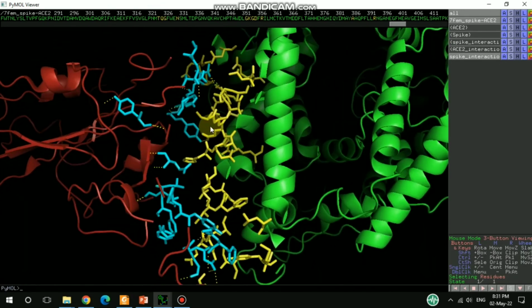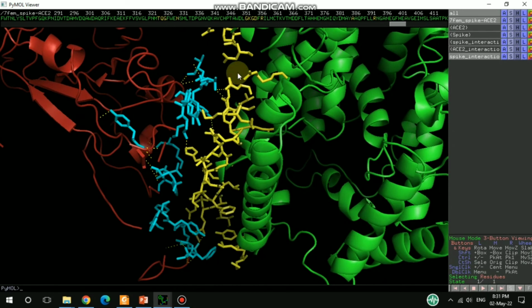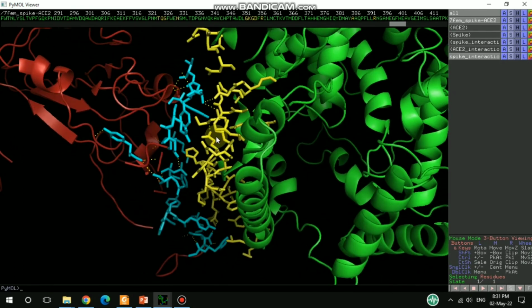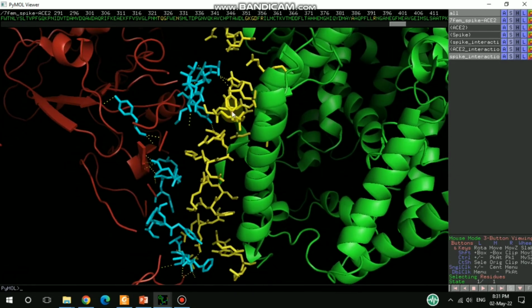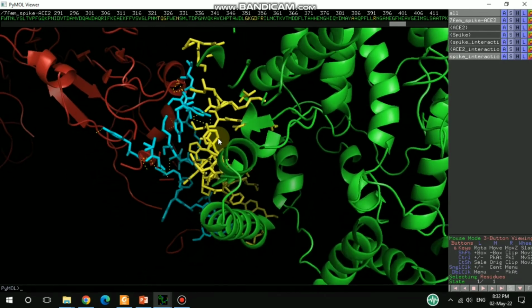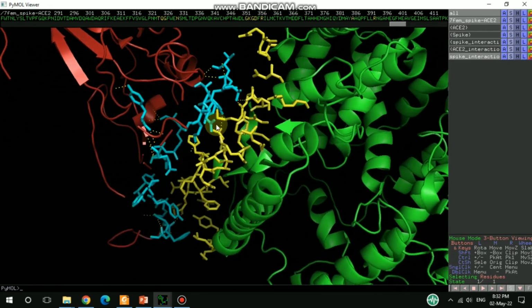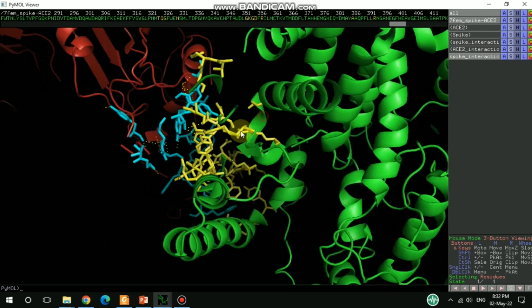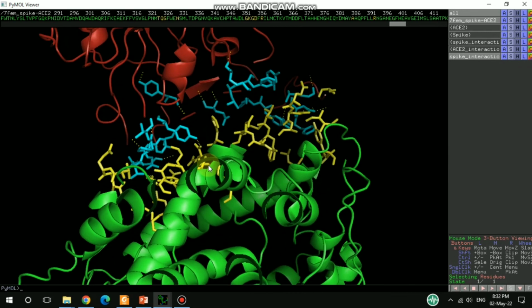This is very clear, you see, and all of the amino acids that I selected are interacting because these are already studied, right? If you do it randomly, it cannot be that perfect. So you see here, this is the structure. Here this is the bond. You can also check it carefully, no problem, you can find it. But if you would like to know the names of the amino acid residues that are interacting between each other, then you can do that as well.